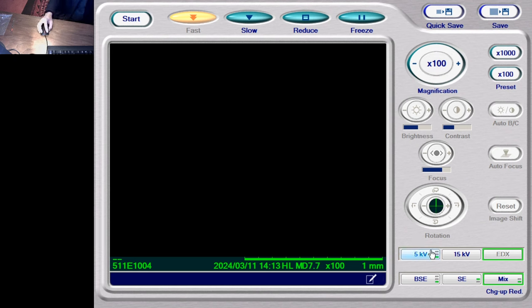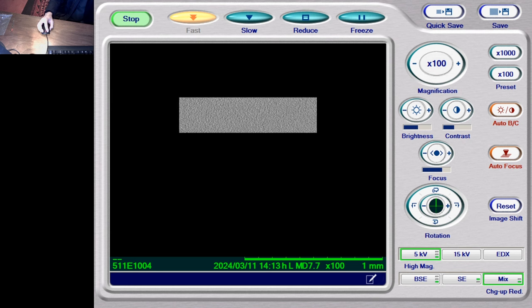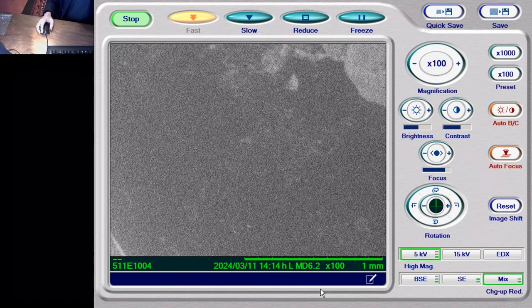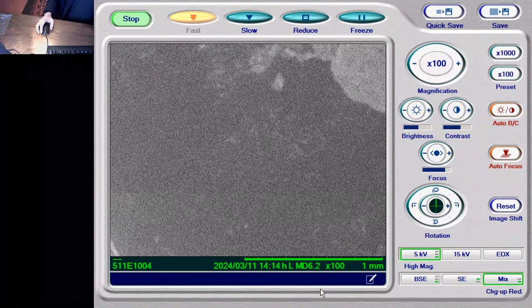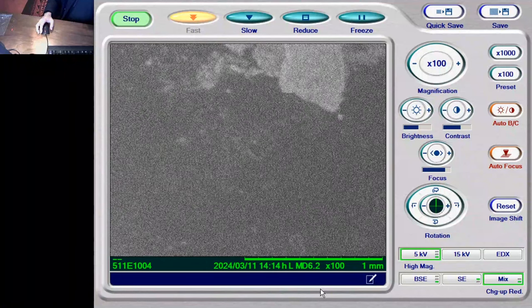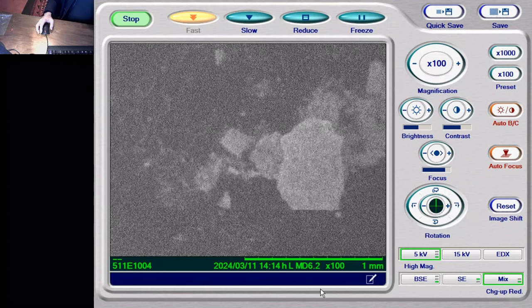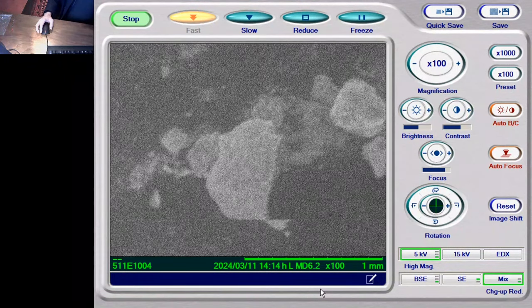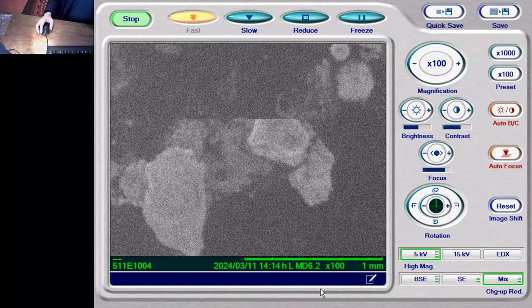So in theory, we should be able to do a sample. So start. It's doing its calibration now. Auto start process, so it's found some things. So what have we got from the inside of Bin-Juine Huang's cavitator? These magnetic particles, what are they? I'm using the hand controls, as is what you need to do on this Hitachi TM3030 Plus, to have a look at these iron-rich particles.